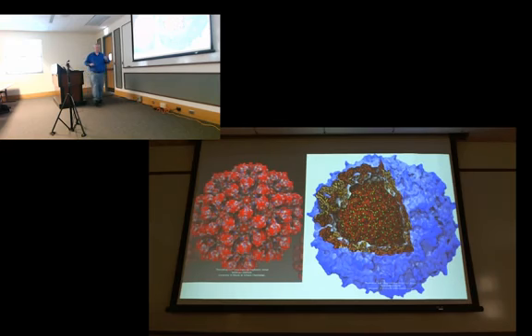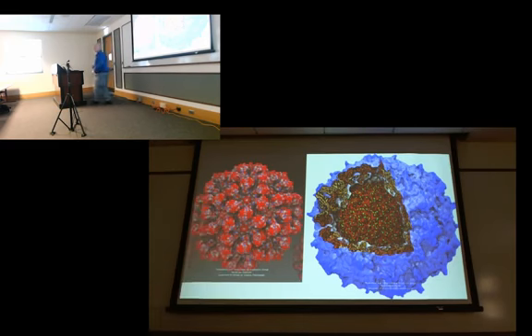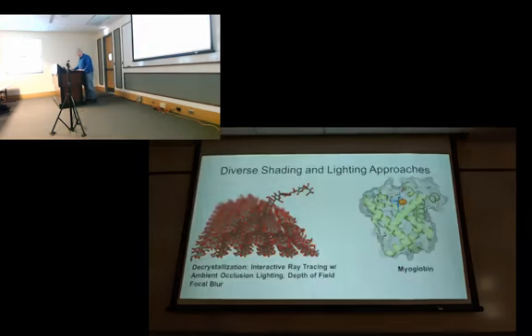Poliovirus is a great example because you have the structure cut open. And this is, again, one of these cases where having the shadowing makes it clear that these things are on the interior of this capsid surface and that this is in the interior below that. If you drew this without the ambient occlusion lighting, it looks very flat, and you don't get this impression of this triangular cut and how far inside the RNA is. Just looking at that, it's much more obvious.